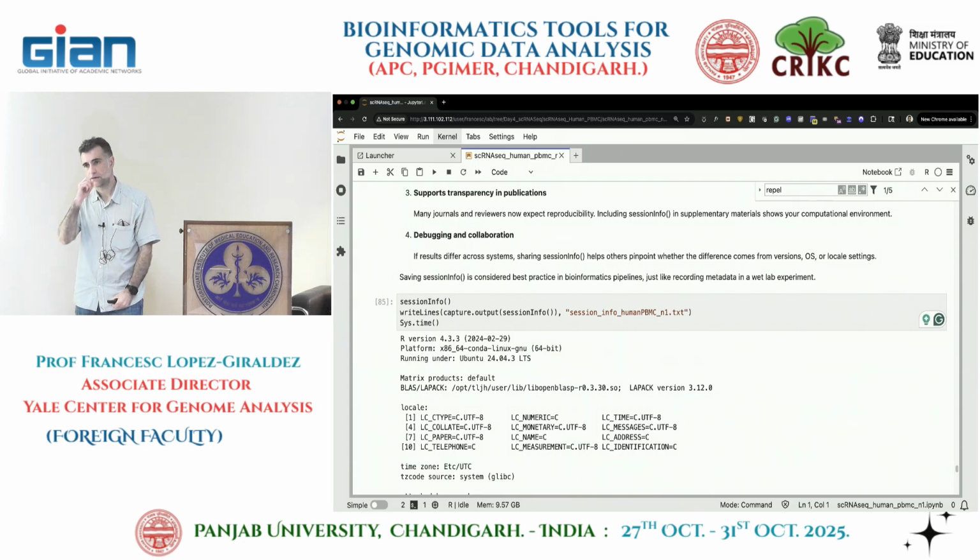So if I'm going to manually evaluate, I just want to confirm how I manually evaluate the cluster. Basically I should sort them by the log fold change, take the highest genes, and then compare them to whatever canonical markers. Yep. And if you Google PBMC canonical markers, you're probably going to get a table. Yeah, I got a whole list. So that's how. But sometimes there are clusters that are really hard to classify because the clustering is going to maybe create a small cluster and there are not enough genes to classify. There are always complications. It's not that easy.